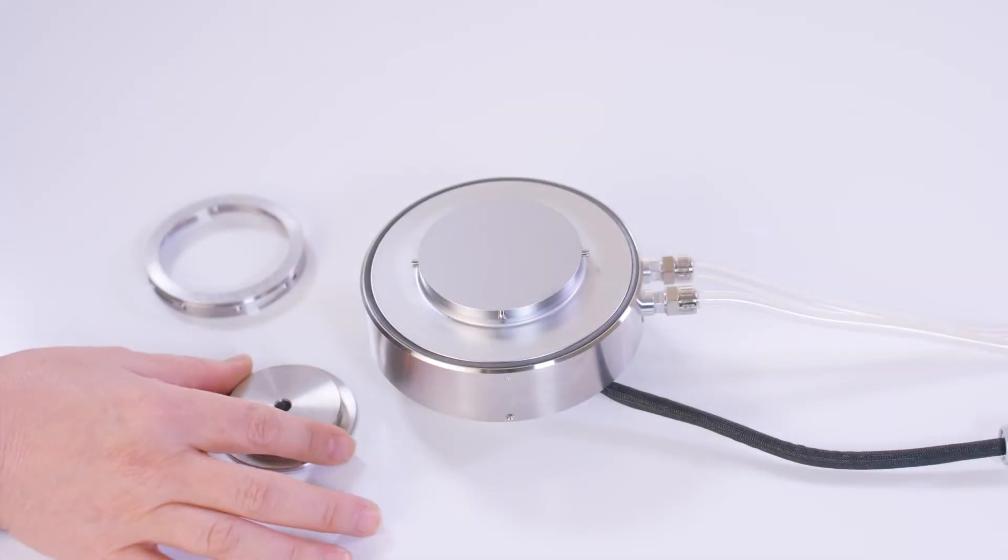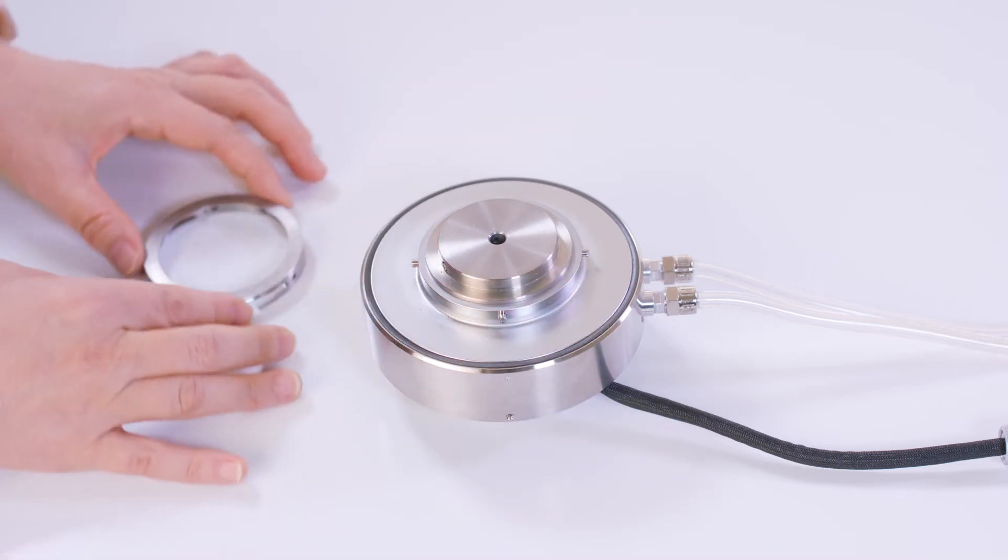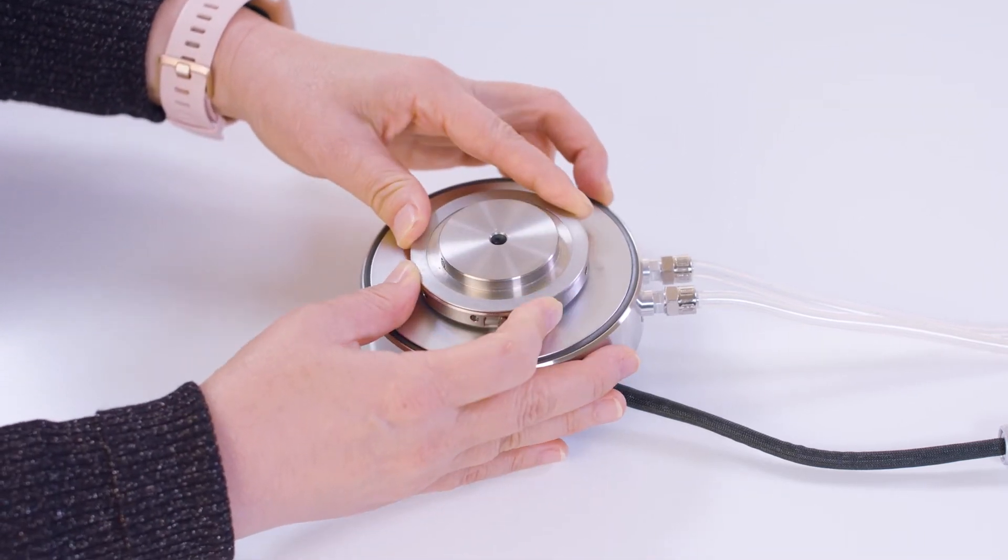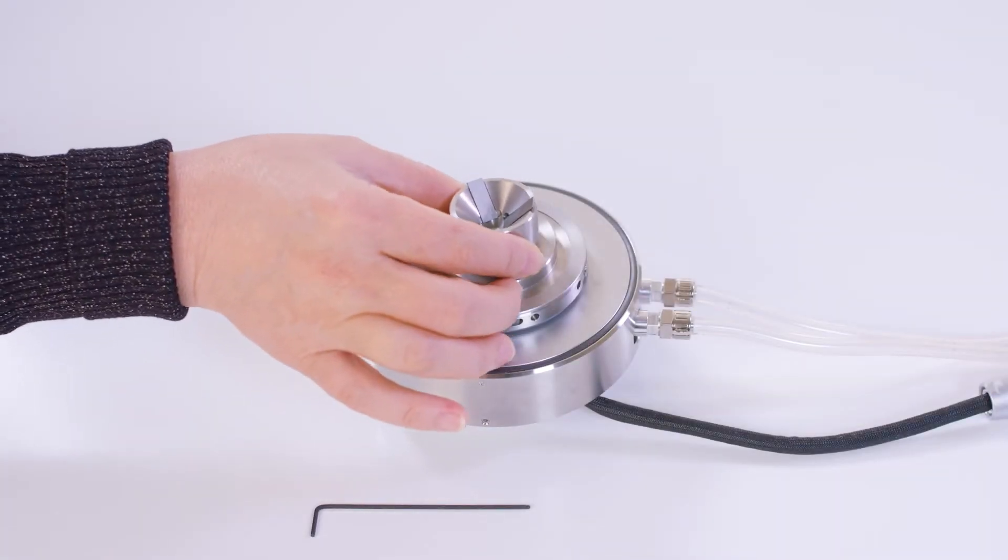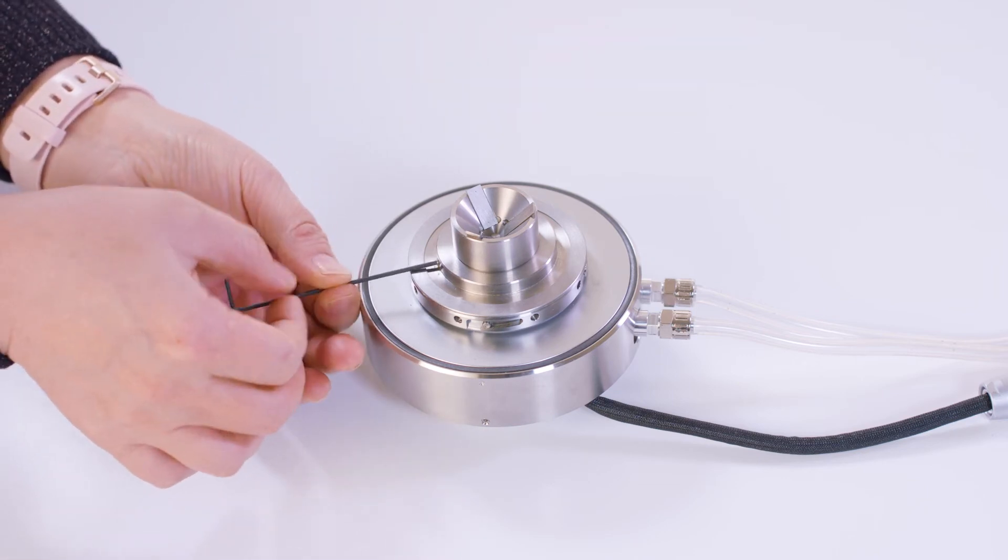If you are using the Peltier temperature control system, for advanced Peltier plate, you will need to attach this tribo-rheometry holder to the top of the Peltier plate first, and then attach this three-plates lower geometry. Tighten the screws on the side.